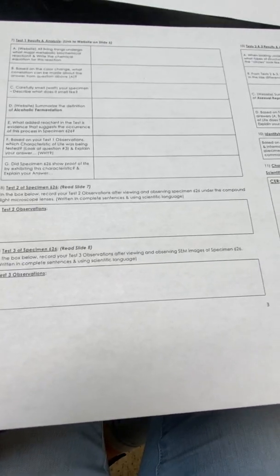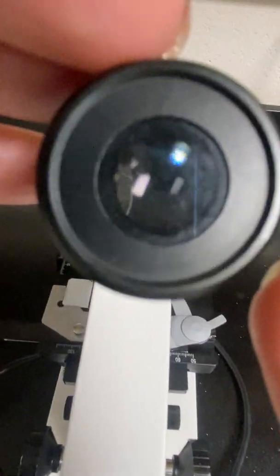Okay, this one, you're supposed to look at underneath the microscope. I'm going to try to put my phone up to the microscope, and see if you can see what the specimen looks like. Give it a second. See those little circles kind of moving around? It's kind of hard to see. Oh, right there, you can see it. All these little circles. Let me try another microscope.